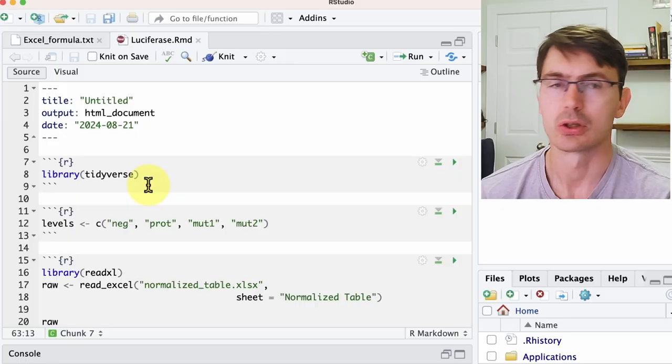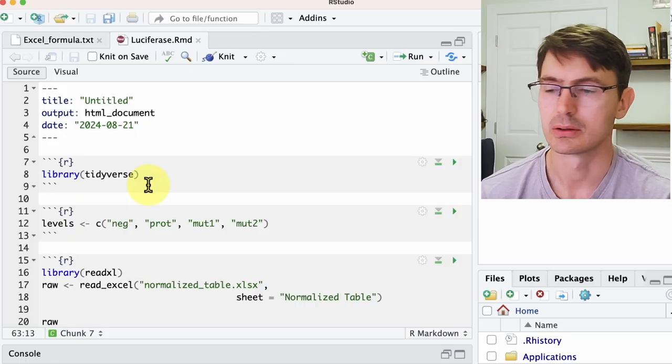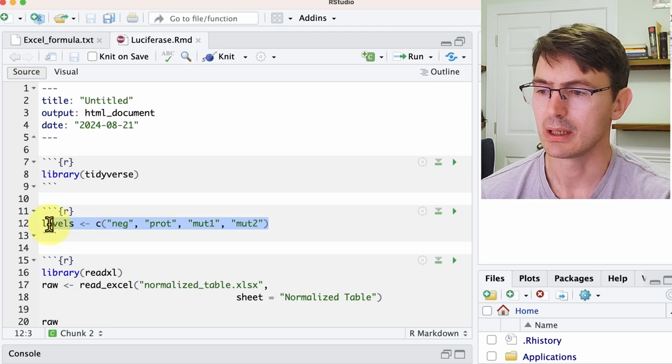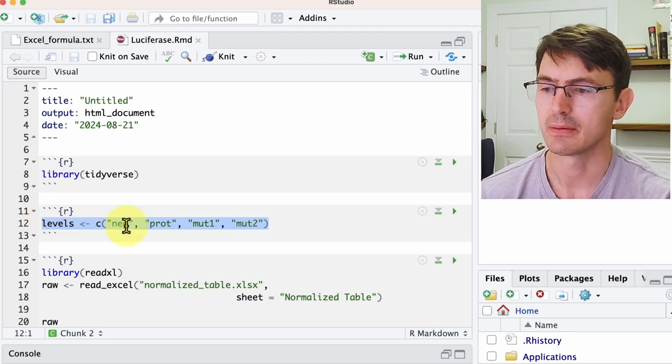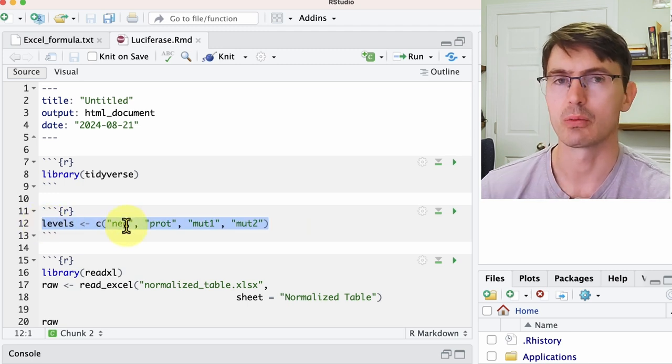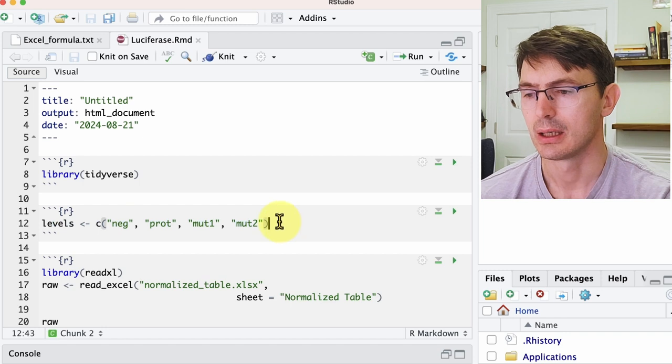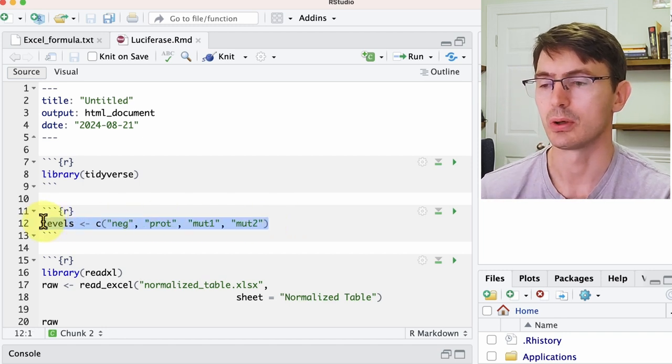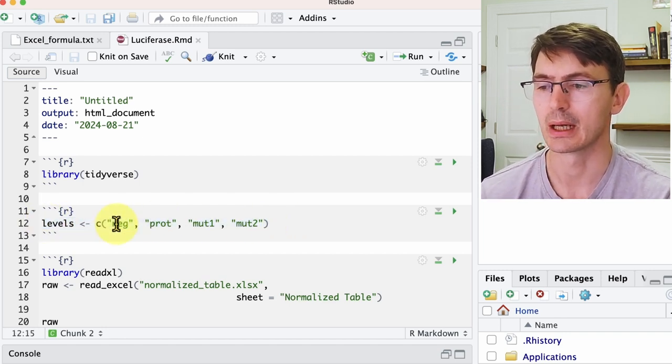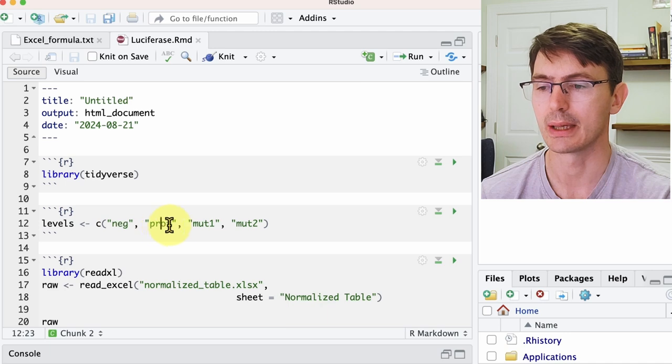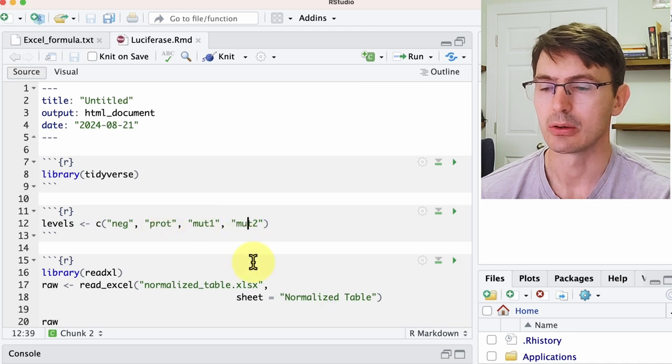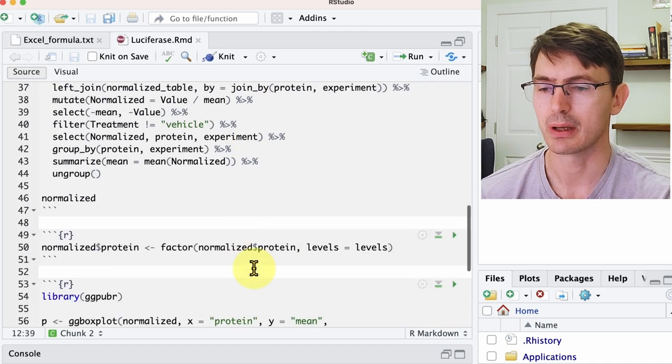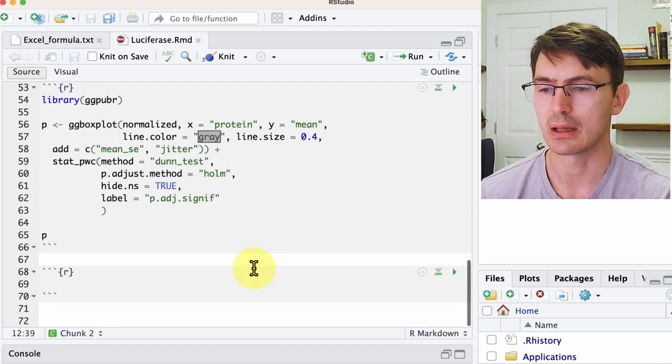Very good. So now we have this table, so what we want to do now is to load it to R and do all the analysis and the plotting. So we do this with this script here, and the only thing that we need to specify is the order in which we want to plot the data. Here is the order in which we want to plot the different proteins, starting from the negative control, the wild type, and the two mutants.